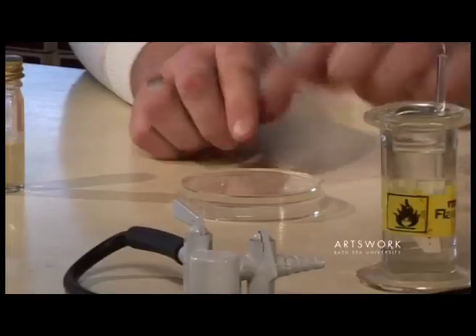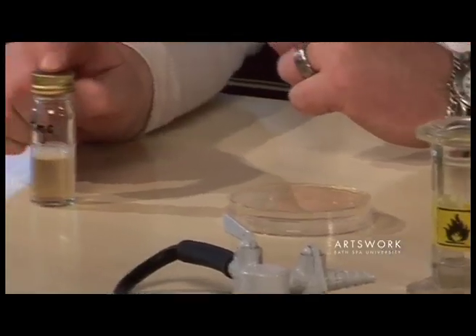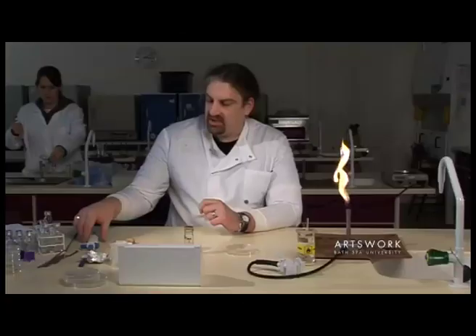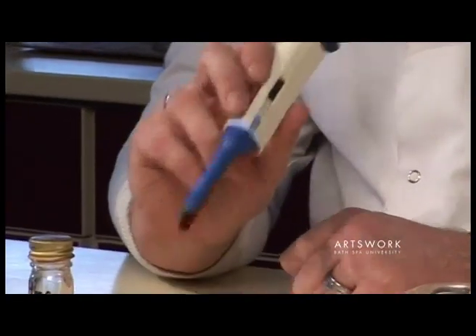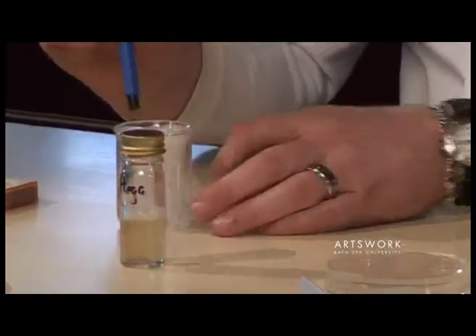To do this we need to inoculate the surface of the agar plate with half a mil of our culture. We have our pipette set up at 500 microlitres, which is half a mil. So I'm going to transfer half a mil of our culture onto the surface of the agar plate.